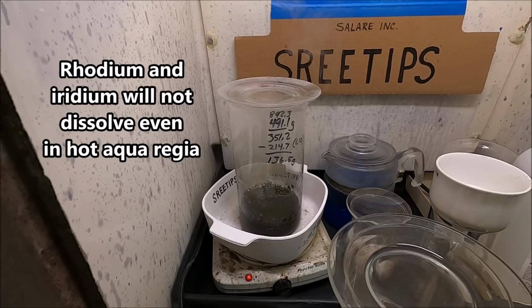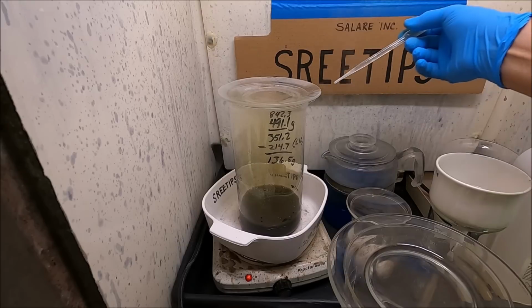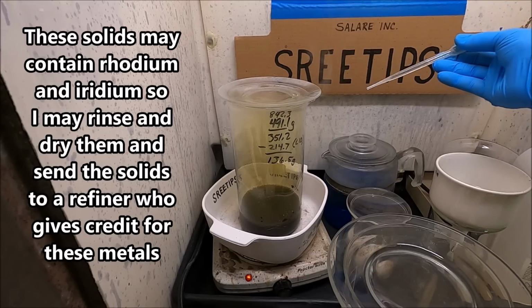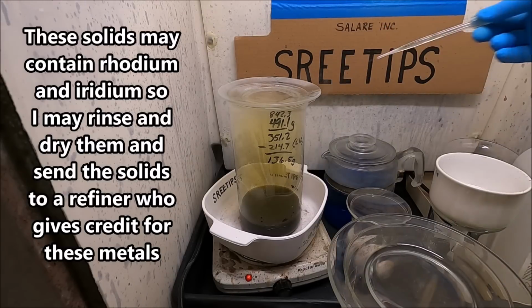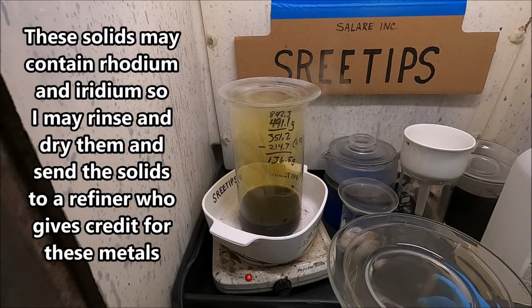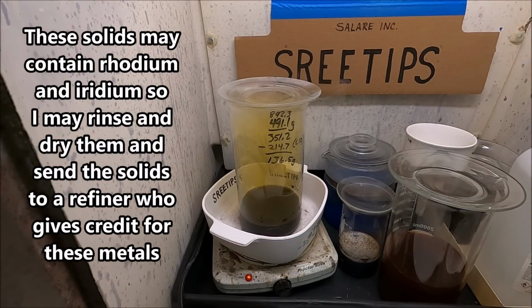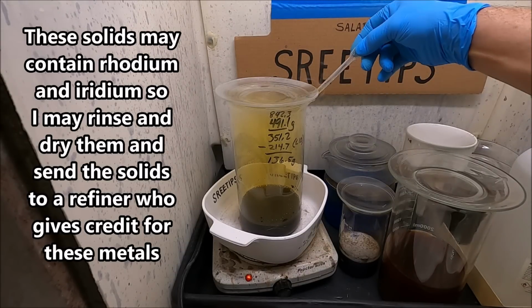I don't see a whole lot of fume production. Alright, there we go. We got a little fumes forming now. A bit more here. Foam looks green, so we may have some platinum group metals still dissolving there. On those nitric additions, we know what happens when we put the nitric in too quickly. So we still got metals going into the solution here, it looks like. Probably not all that much.